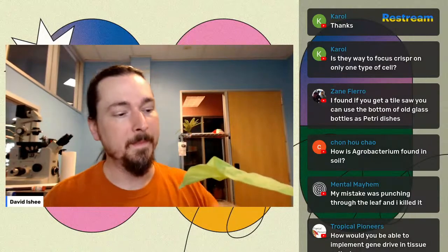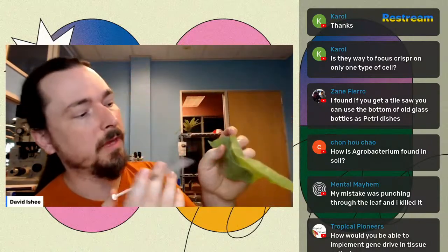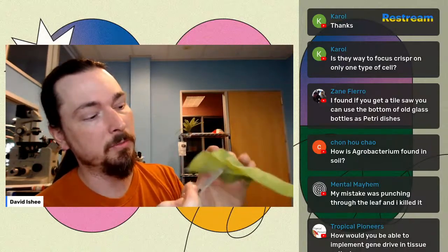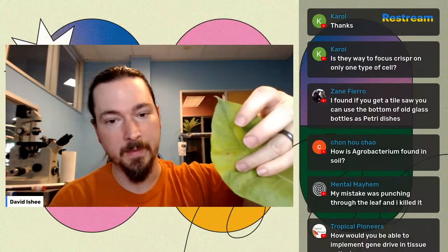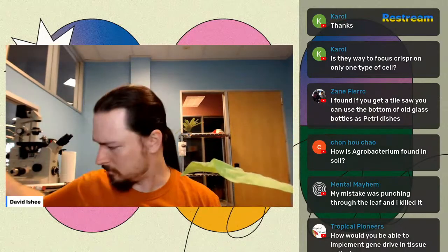All right. One of the most common mistakes is people just push too hard, right? If you push too hard, you'll punch right through the leaf and make a hole. And then that part of the leaf will just die because it's a hole.